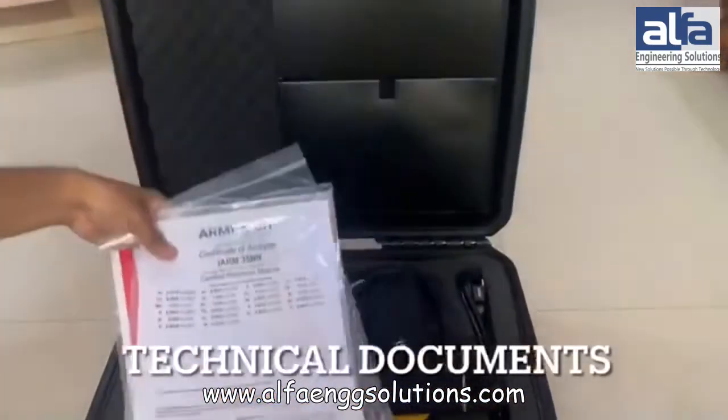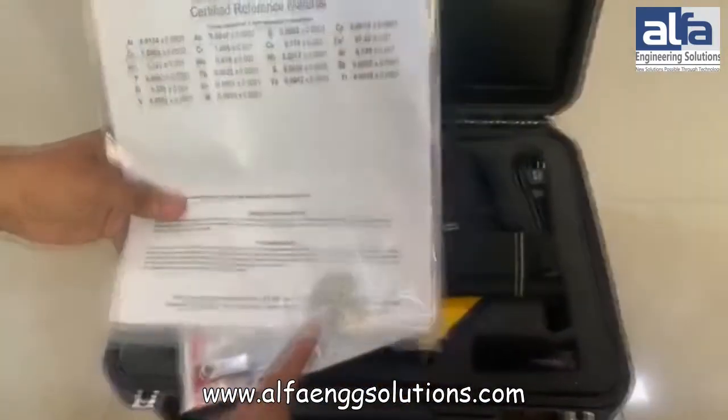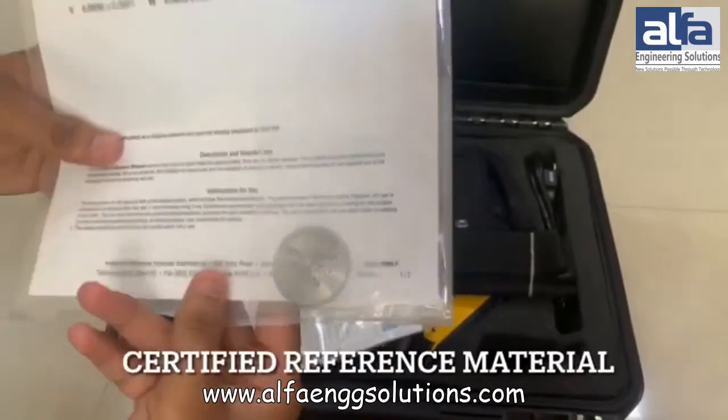These are some booklets showing the technical specifications of the Thermo Fisher Niton XL200G. This is the certified reference material.